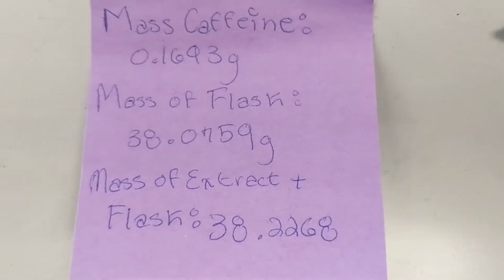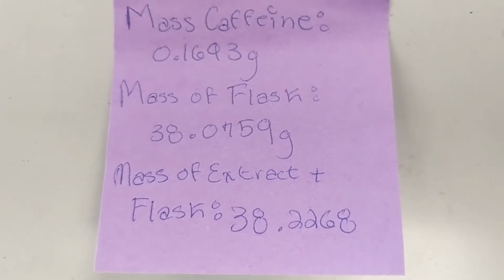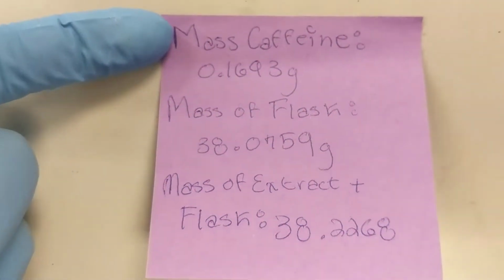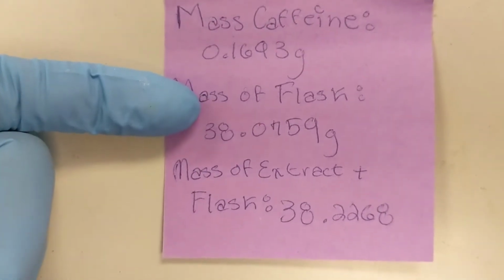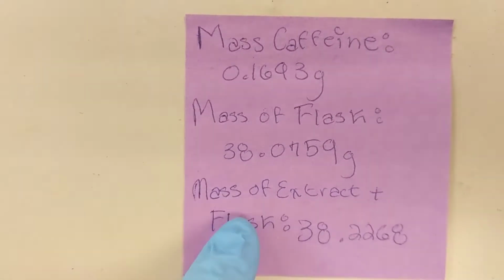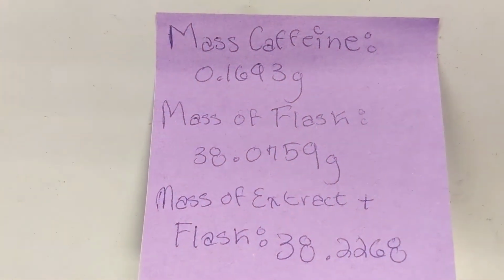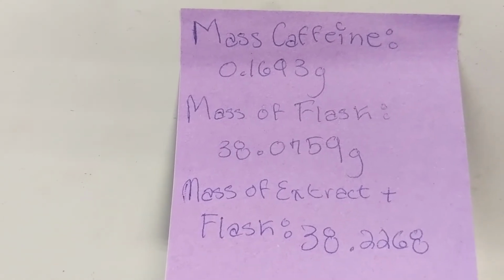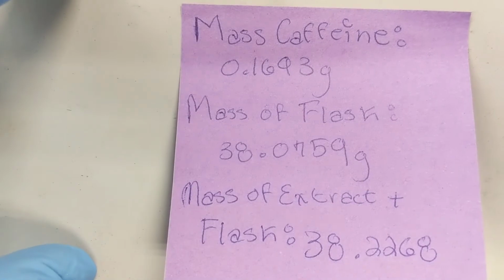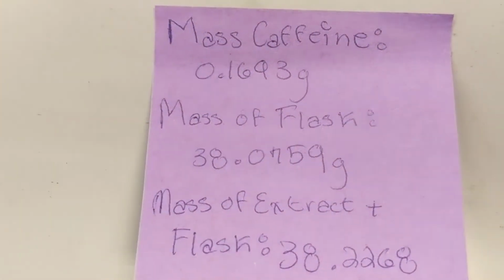Here's your final data for experiment 3A. This was our initial mass of caffeine we added to the water, the mass of the flask, and then the mass of the extract plus the flask. So this is about an 89% yield of what we put in and what we got out, which isn't too bad. All right, on to experiment 3B.